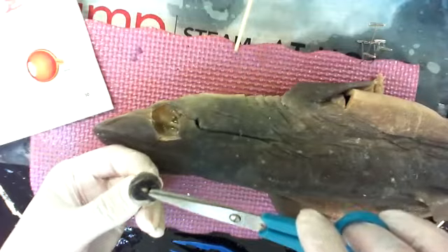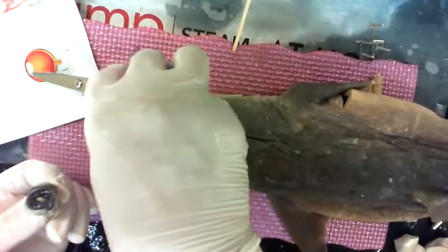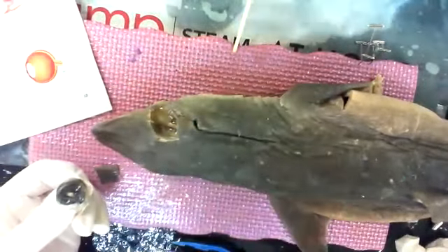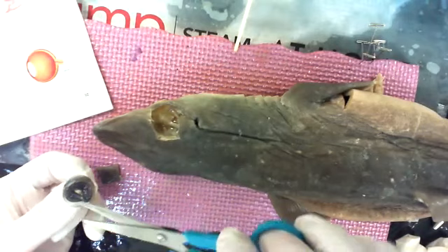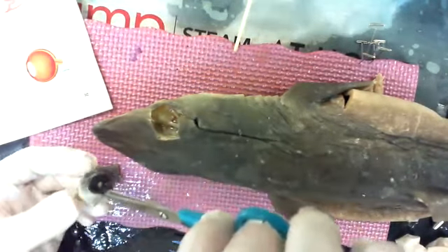That white thing in there is the lens. So normally the lens is like a magnifying glass. Light comes through, the lens bends, it's stretchy, so it's squishy when you're alive. But when you die, it darkens over, it clouds and turns hard. So we'll cut in to get to the lens.